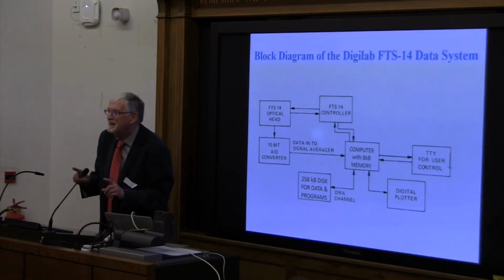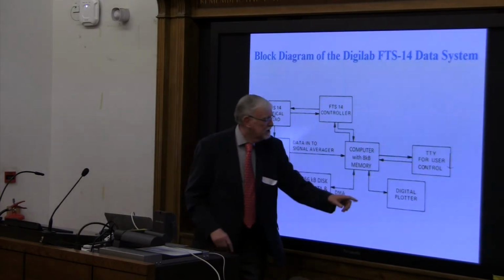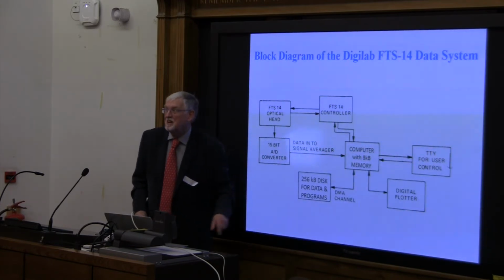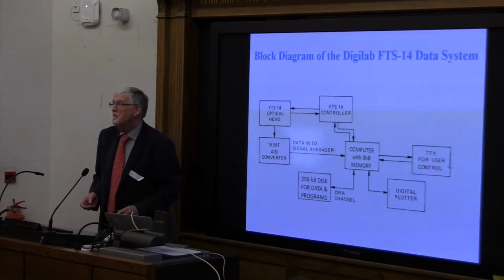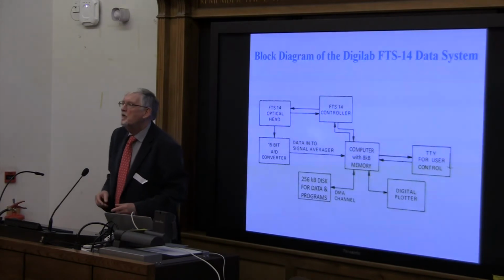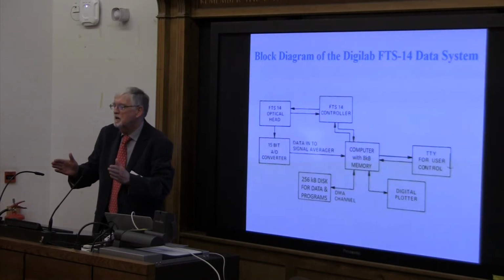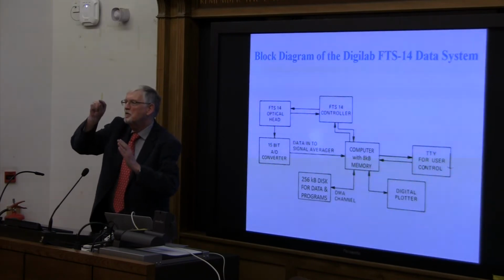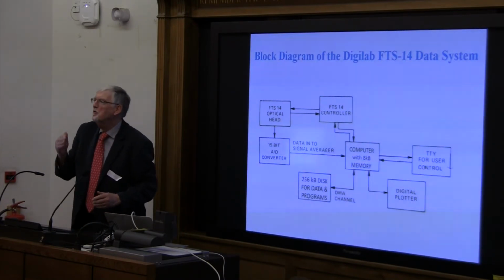K, not M. Young people. The whole thing was controlled by a 256K disk. All the programs, all the data storage had to be put on this disk. The memory on the computer here was ferrite core, and so you could see this great big memory board was about this big here, just with a whole bunch of little rings of ferrite core units on it.